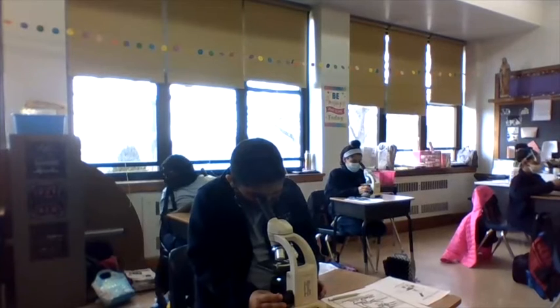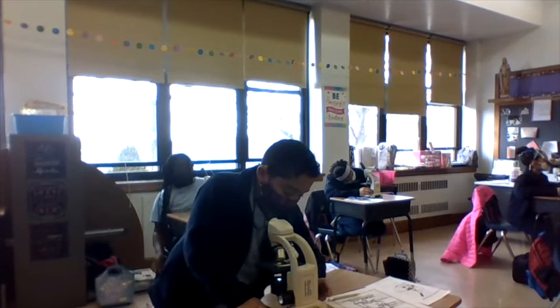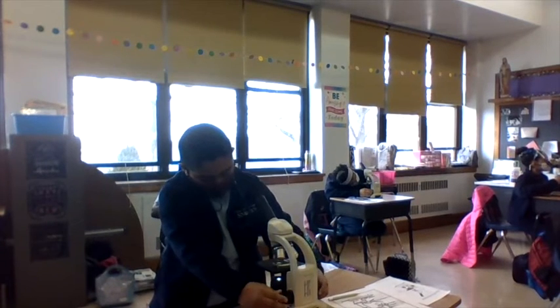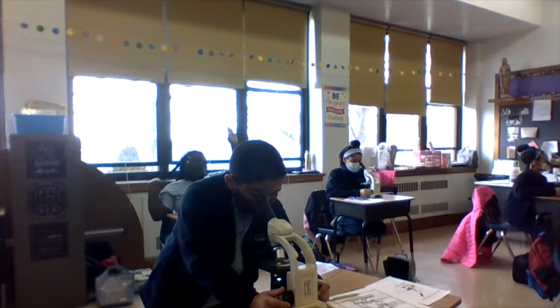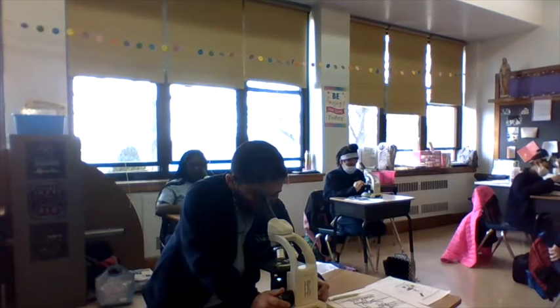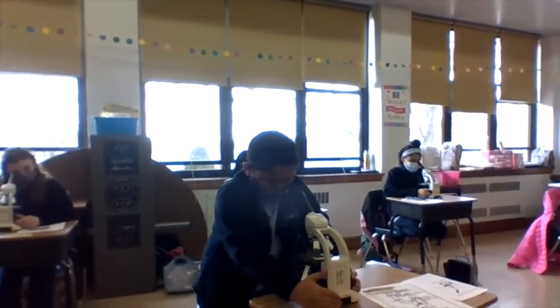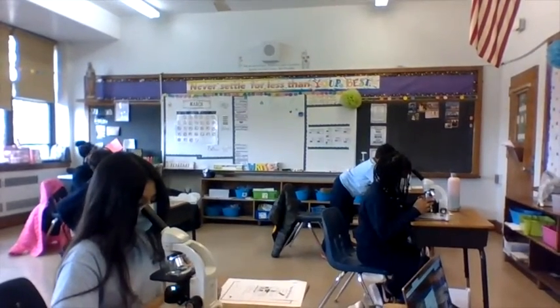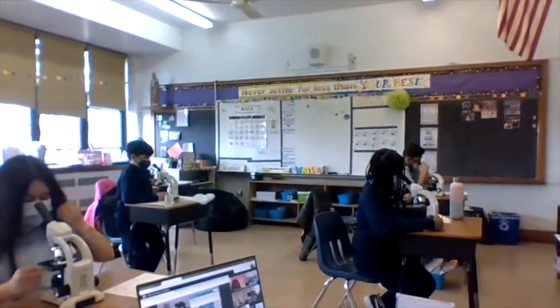Green brick with fingerprints on them. Say that again, Julia. The plant cell kind of looks like green brick with fingerprints on it. Yes, agreed. Thank you for sharing. It looks like little bamboo sticks. Layla says hers looks like little bamboo sticks. So when you magnify a piece of a leaf or stem, that's what it looks like inside.